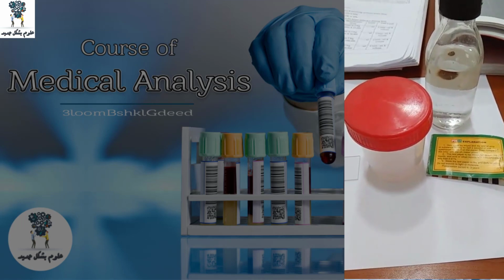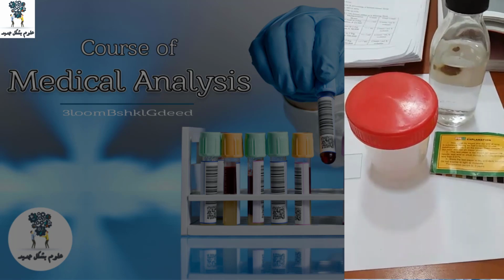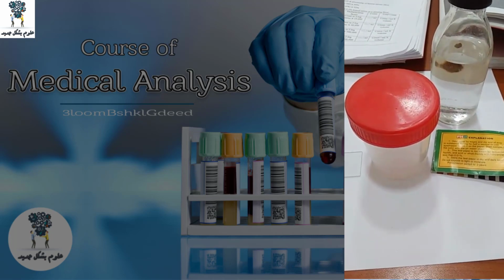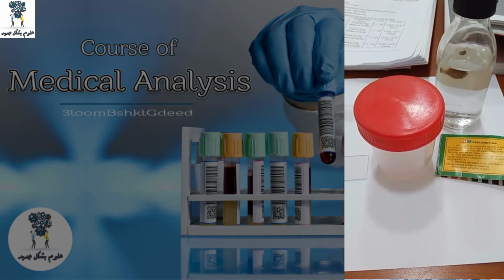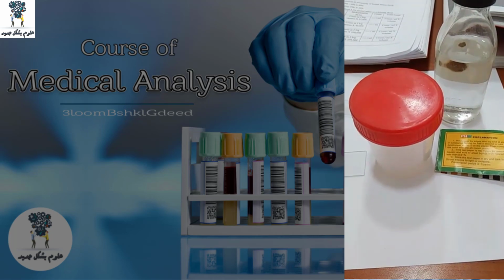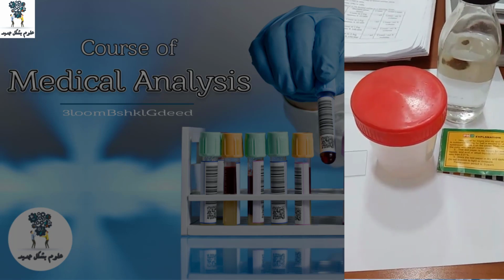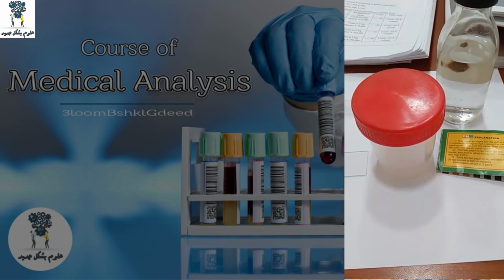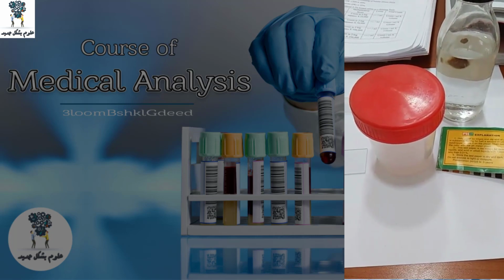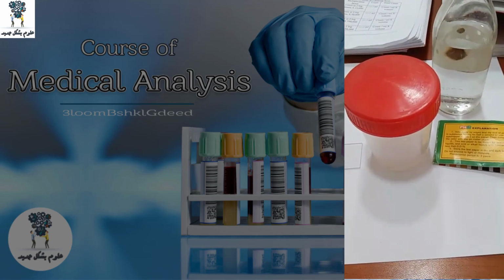People make this test as there are different problems like shrinkage of testes, or there are problems after marriage, or just a checkup before marriage. So this test is very important as it is a test for measuring fertility for males. So we should make tips for the report itself. So how can we start?